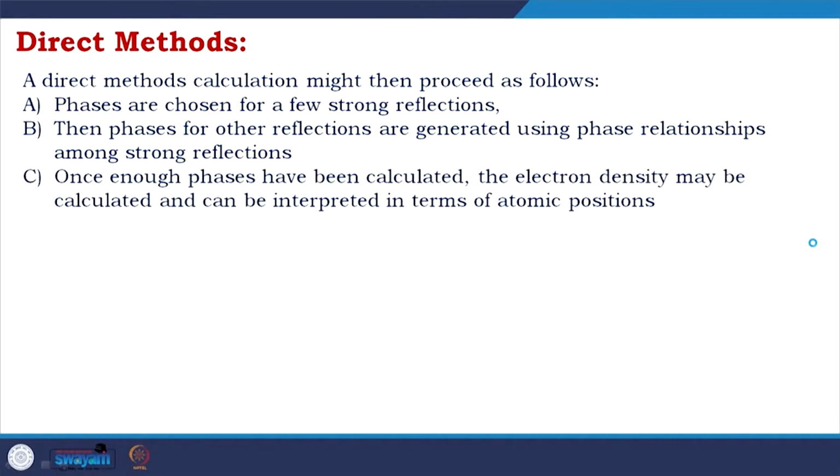Once enough phases have been calculated, the electron density may be calculated and can be interpreted in terms of atomic positions.